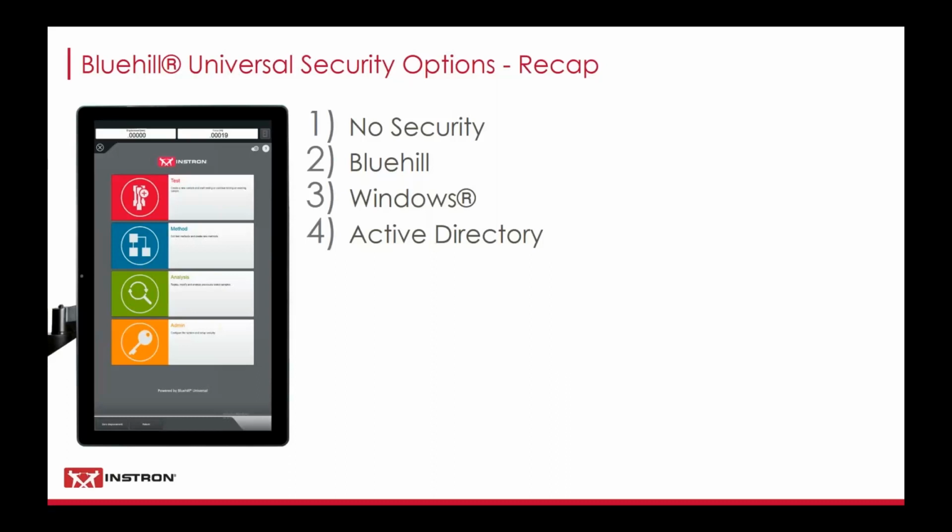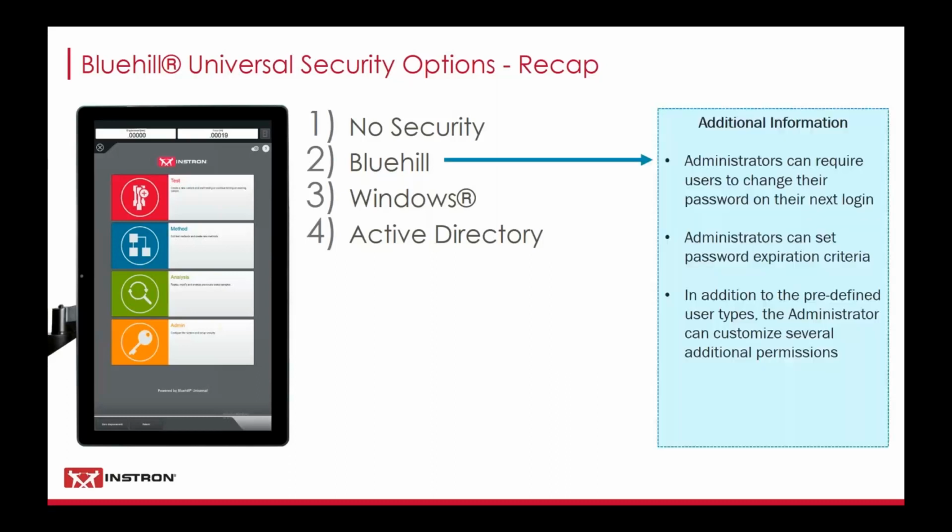But if you do need to lock down the permissions a bit more, if you're in production testing or quality control, there are 3 options. There's the Bluehill based, the Windows based, and Active Directory. So just some additional things that I wanted to mention.